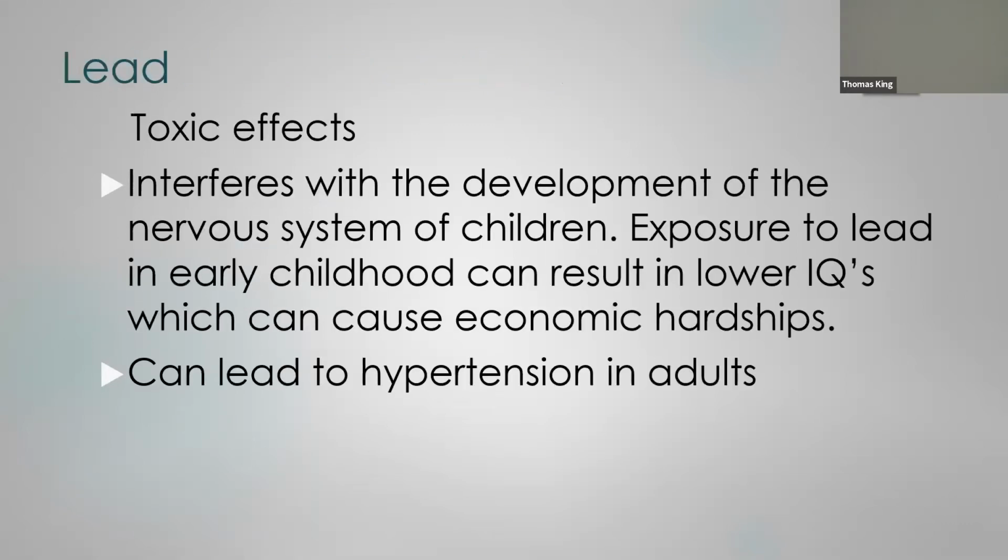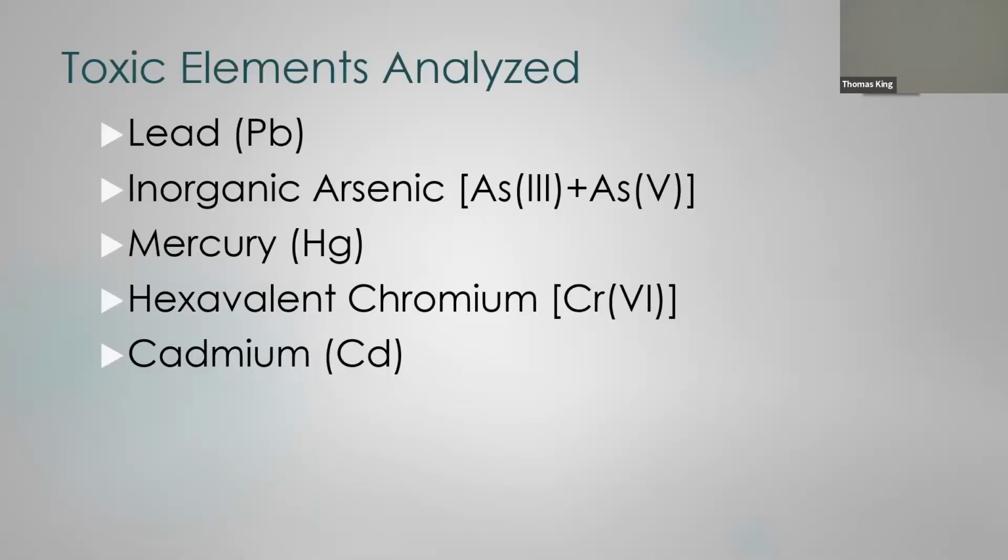I will talk about the toxic effects of each element, the sources, and major causes of poisoning. Then I'll discuss how we analyze toxic elements in different types of foods and how our instruments work. Next slide.